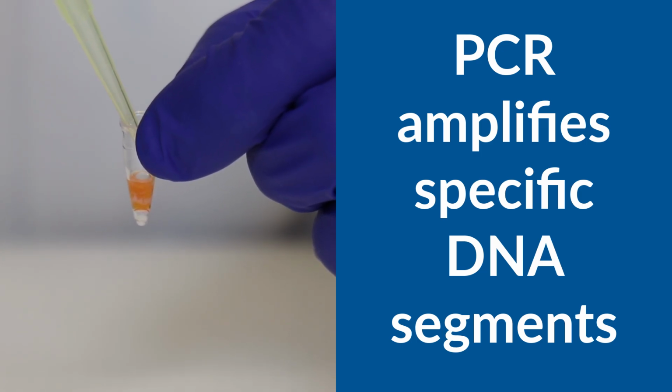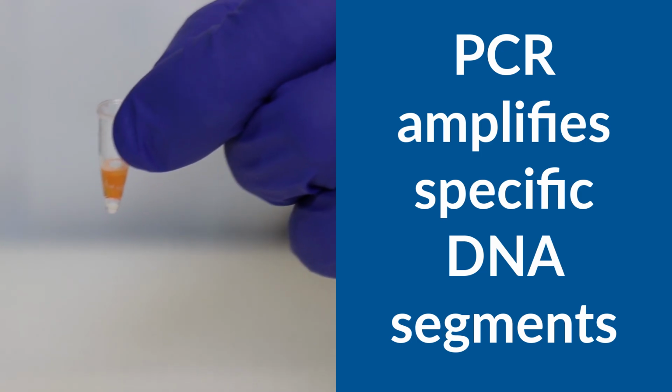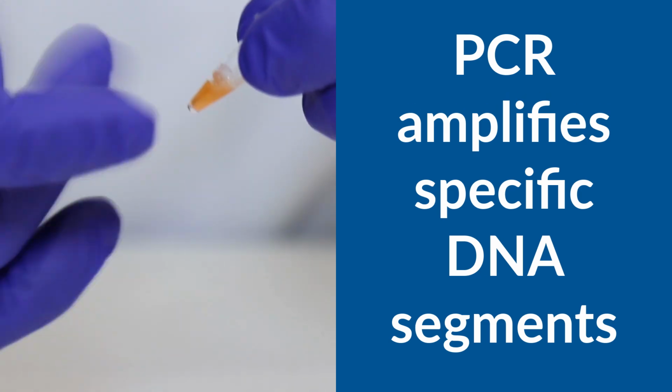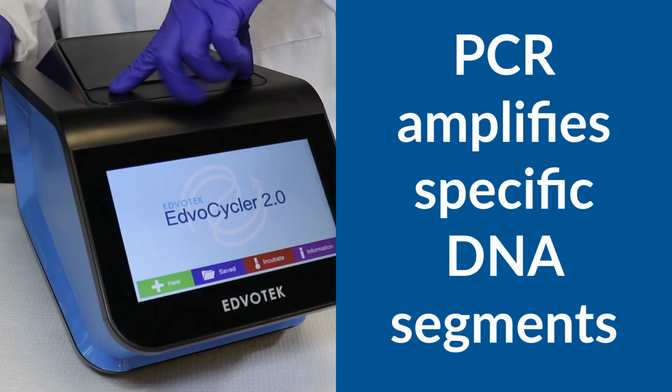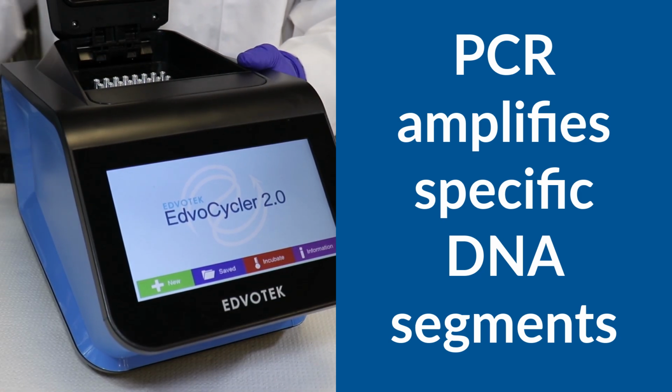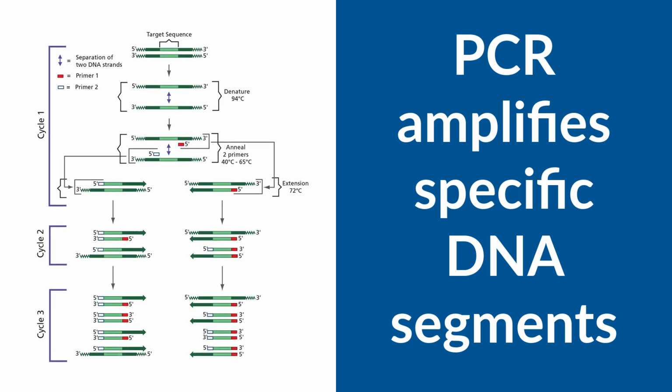So what exactly is PCR? Well, PCR stands for Polymerase Chain Reaction, which is a biotechnology technique that allows scientists to make millions of copies of a specific DNA segment. It is not a perfect analogy, but we can think of it like a photocopying machine for DNA.